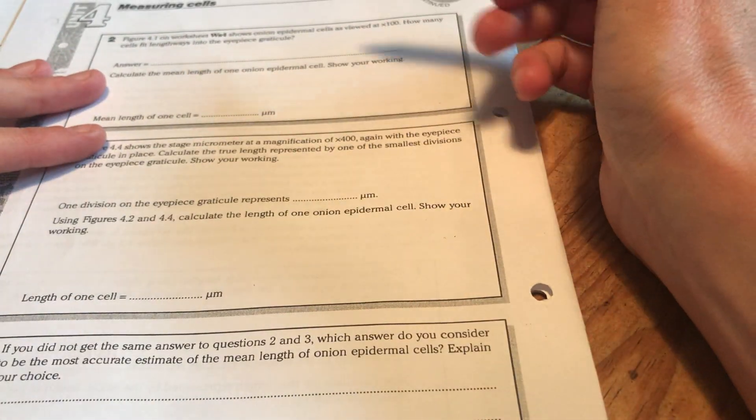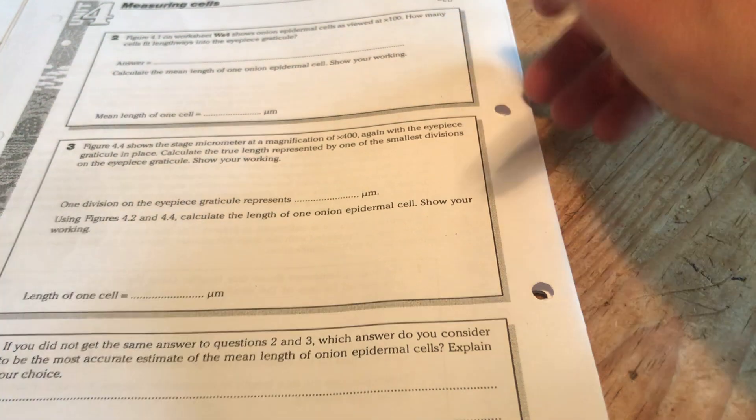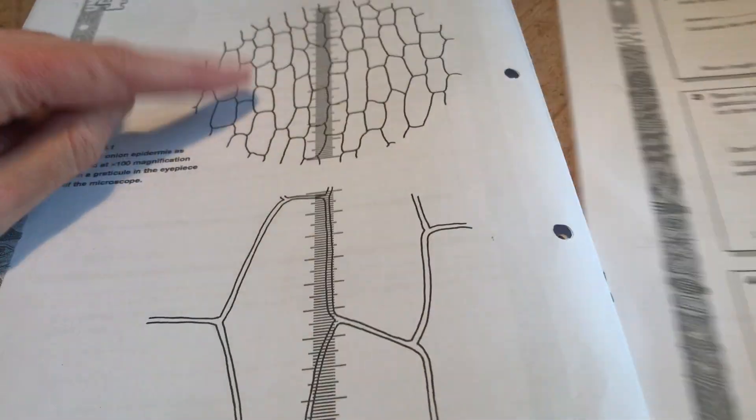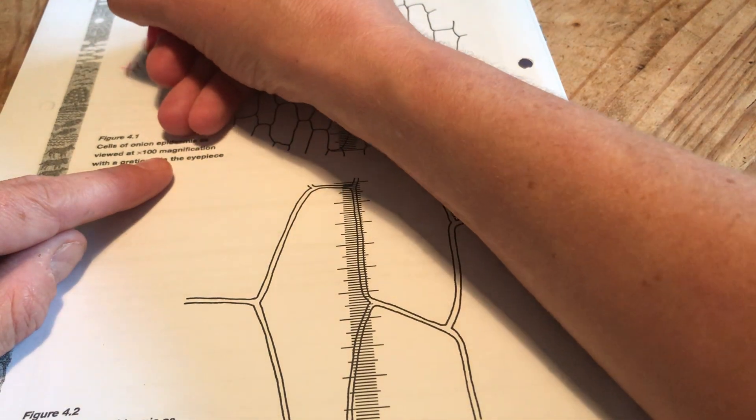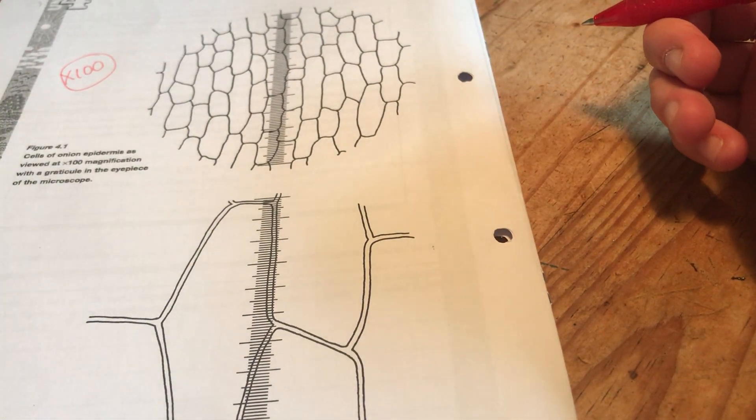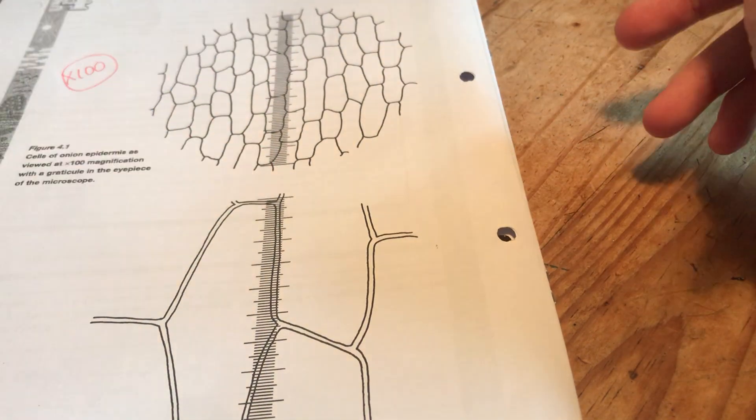So figure 4.1 on worksheet four shows an onion epidermal cell viewed at 100. Let's find that one. Figure 4.1, here we go, this one. So this again is at times 100 magnification. That's the same as I had here. And it's asking me how many cells can fit lengthways into the eyepiece graticule.